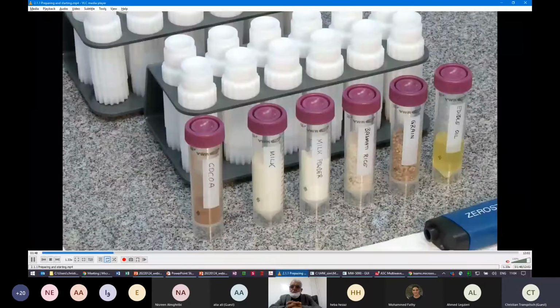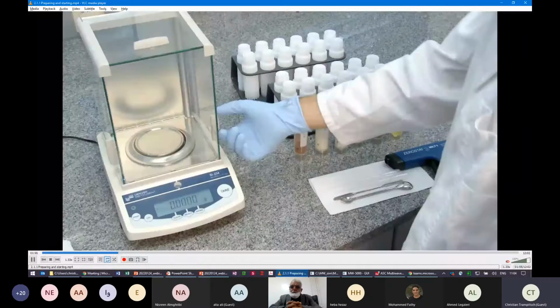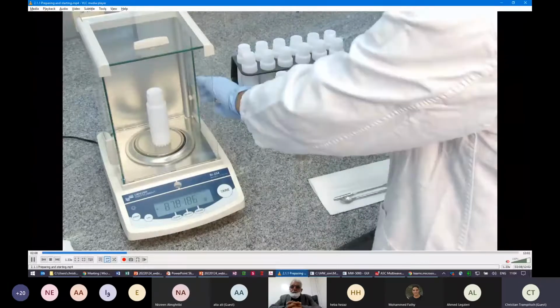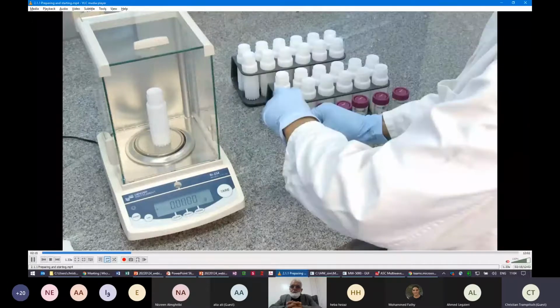What we can also do is digest various types of food samples within one run. One sample will be more reactive, it will vent earlier or more than another sample, but at the end, all the vessels will reach the same or almost similar temperatures for the digestion.